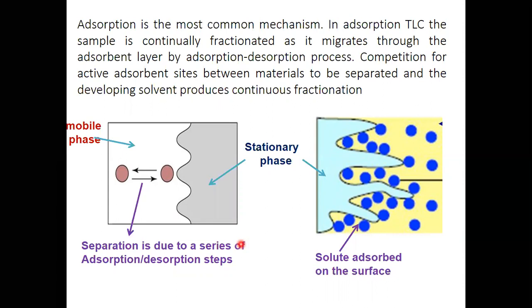That means separation is due to a series of adsorption-desorption processes. During this, there is competition for active adsorption sites between the material to be separated and the developing solvents.